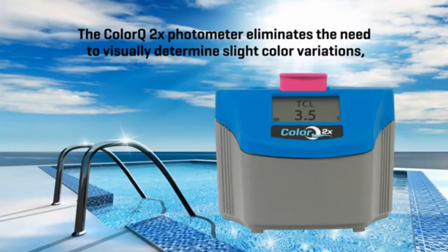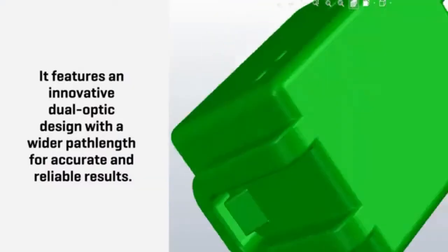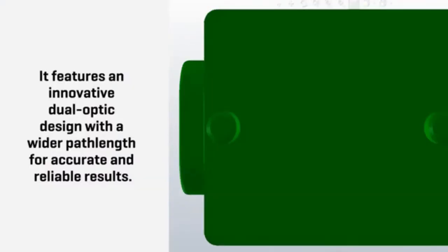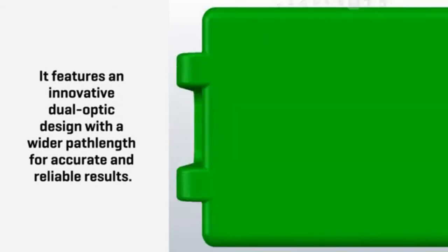The ColorQ 2X photometer eliminates the need to visually determine slight color variations, thus taking the guesswork out of poolside water analysis. It features an innovative dual-optic design with a wider path length for accuracy and reliable results.